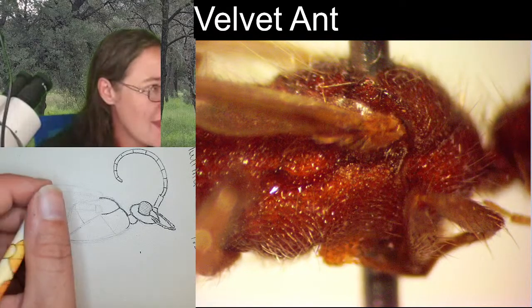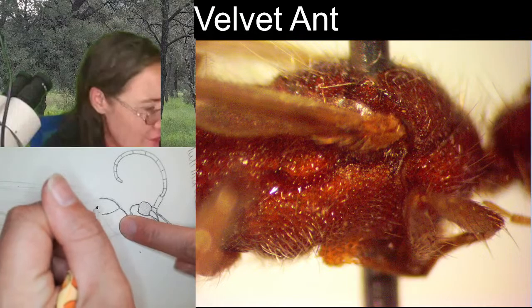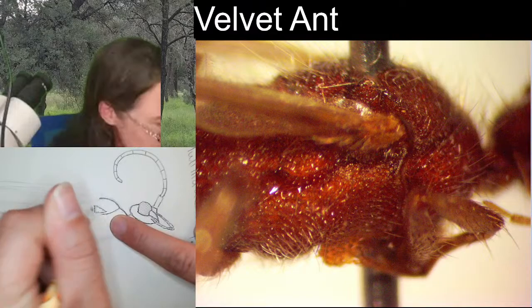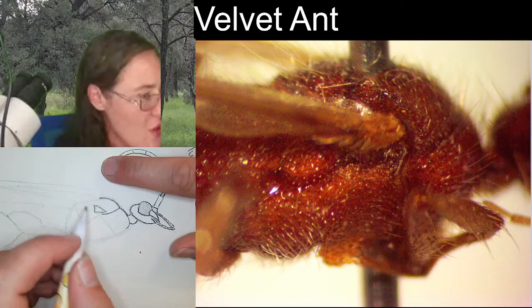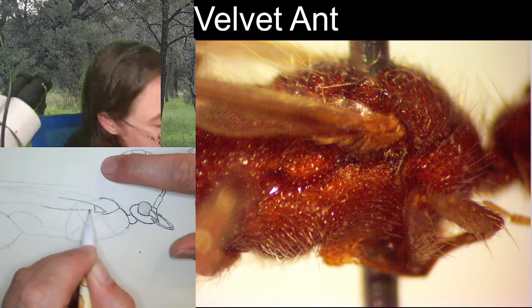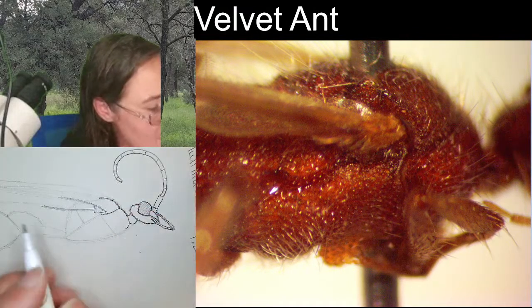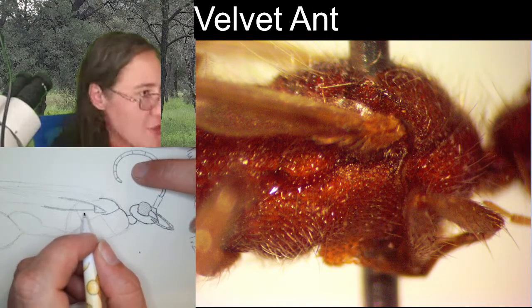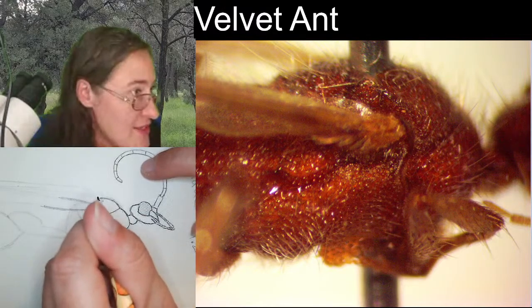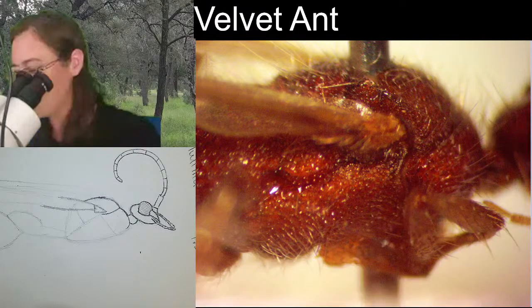That right there is the tegula. In this specimen, it is less D-shaped and more like a V. It's a little bit sharper here, but it still does connect up to the wings that go in this direction. I am going to go ahead and give it at least the portion of the wing that is going to be interacting with the mesosoma. And then this is gonna come around and move down, but then it hits the wing, so we're gonna scooch it over so we can see the rest.